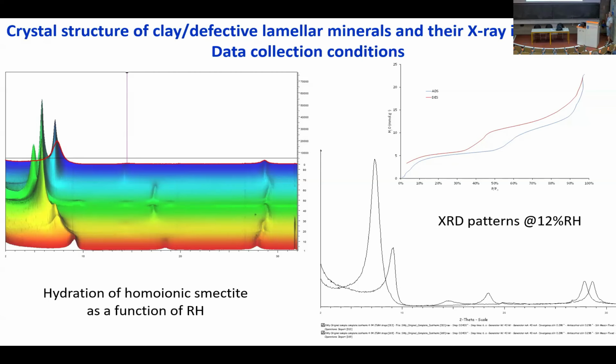But if you think about doing the same thing with water adsorption isotherms, I'm starting from this point here, which is essentially this one. I'm going up with 1 plane of interlayer water molecules, 2 planes, 3 planes somewhere here. And then I go back to 2 planes, 1 plane, and I cannot reach the completely dehydrated state. So we have, in all cases, the same behavior exactly as we see here.